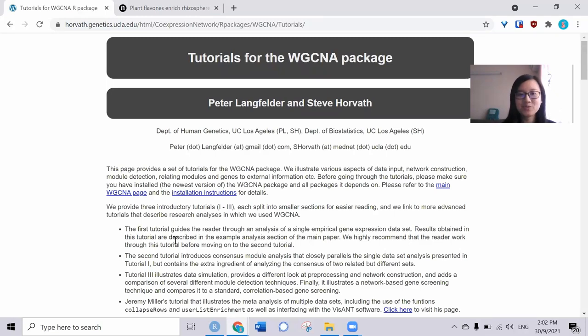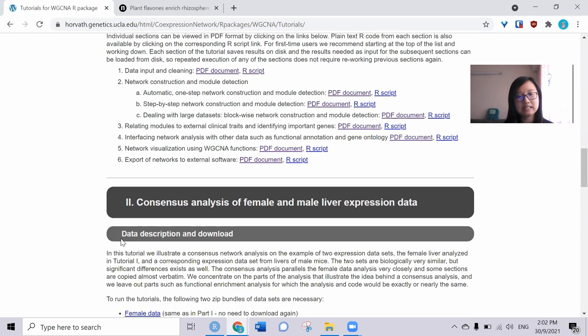Hi everyone! Welcome to RecruitWin. In this video, I'm going to demonstrate how to perform WGCNA in R. There's a tutorial provided by the creator that shows very detailed information for every step. However, this is quite lengthy and quite hard for beginners to understand.